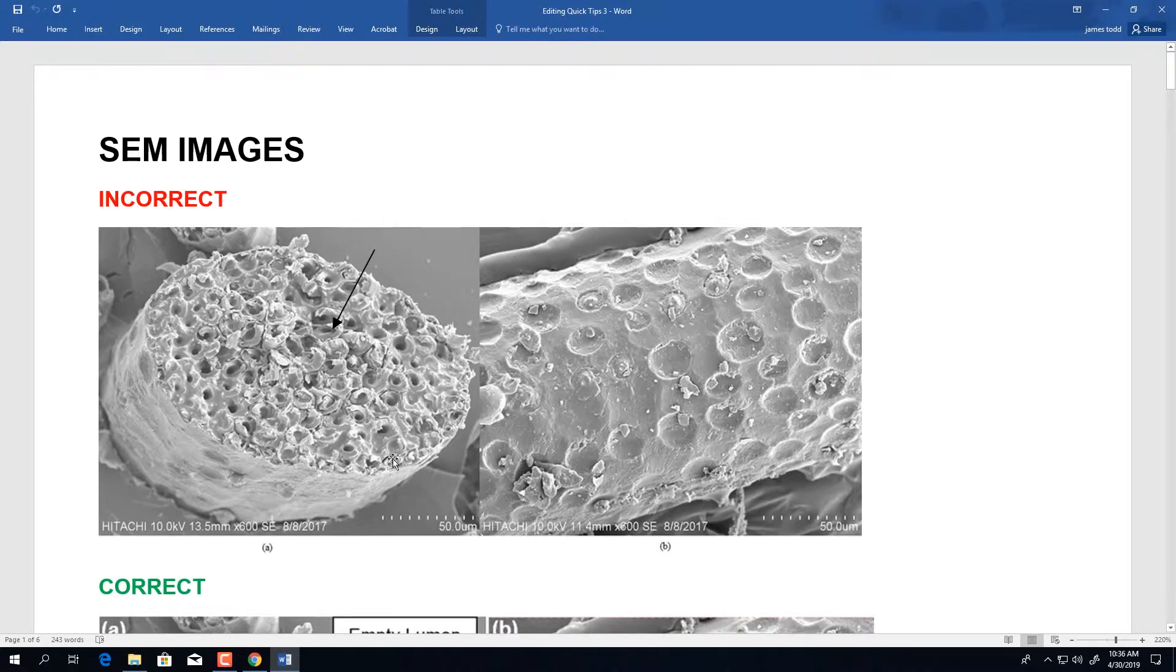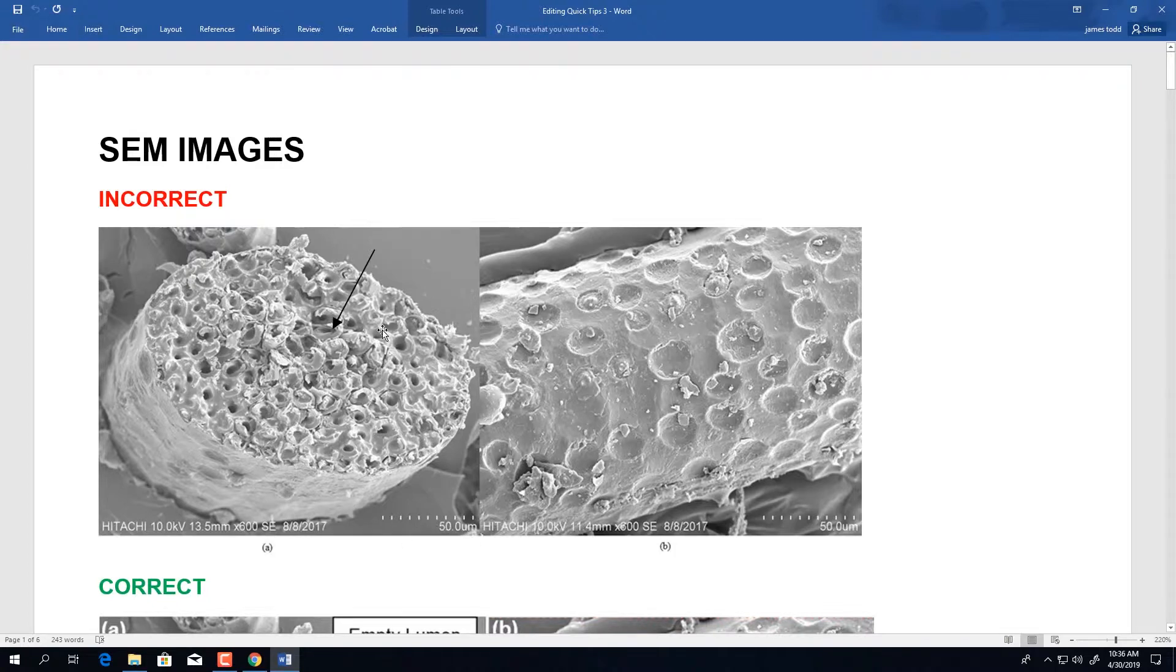In this image that was submitted to us, we do have the microscope generated information in the bottom left corner as well as the scale bar. Notice how there's arrows pointing to the image with no explanation.